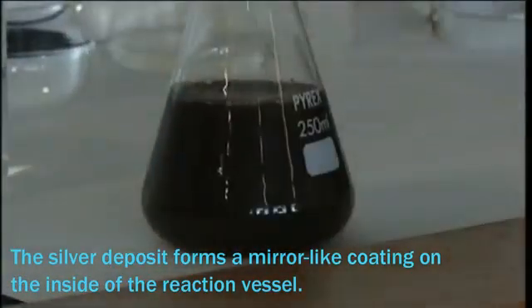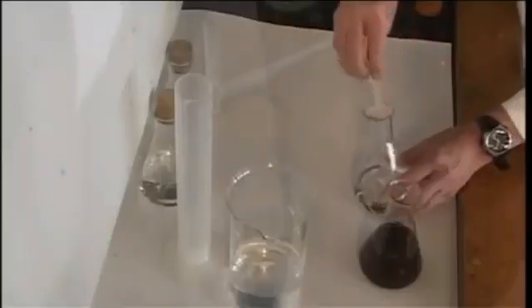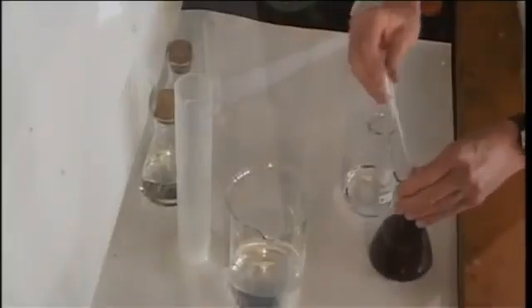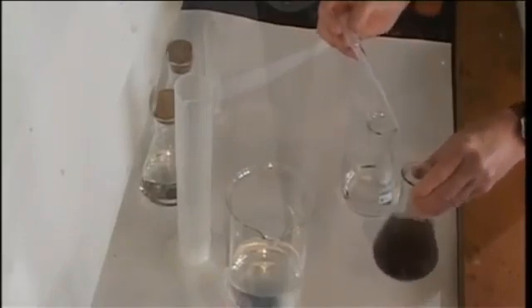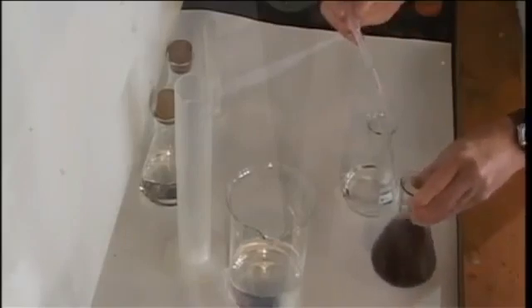Again we get a brown precipitate of silver oxide and we add more 880 ammonia to this a drop at a time again until the precipitate re-dissolves to give a clear solution.